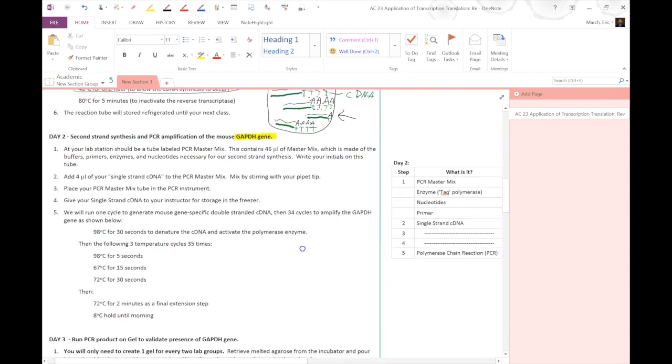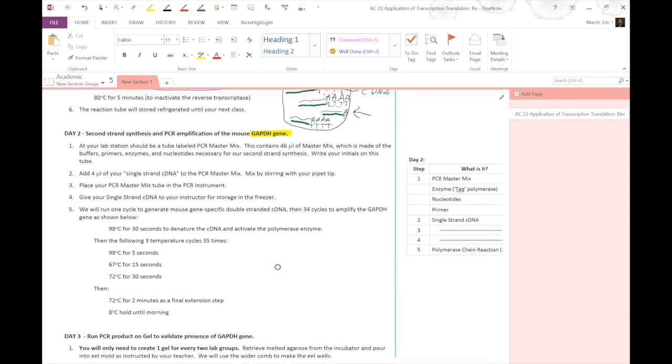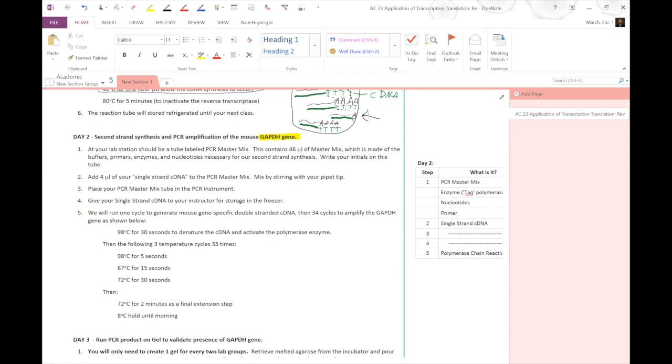Day 2 is all about amplifying the GAPDH gene and not amplifying any other segments of DNA that do not contain the GAPDH gene. So here's what we're going to do. We're going to add a little bit of our master mix at our lab stations. We created a master mix that contains all the buffers, primers, enzymes, and nucleotides necessary for our PCR reaction. We put it all in one tube. That way it's easier to aliquot it out and we don't accidentally leave anything out.